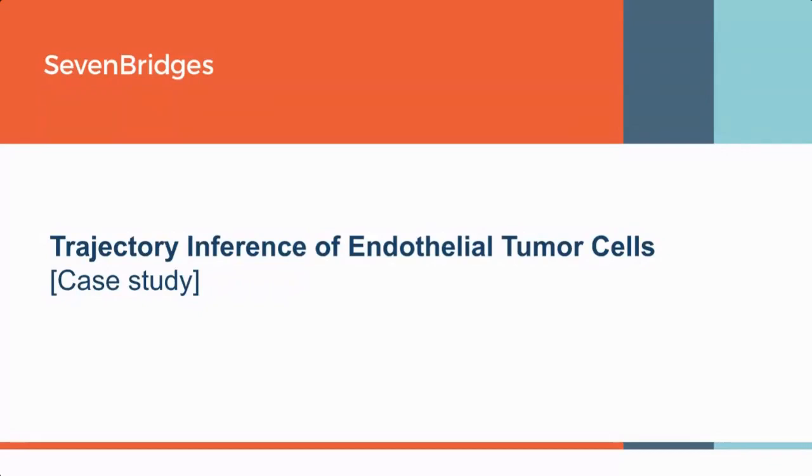This would be our last example of how these tools can be used, and we would like to present the trajectory inference analysis conducted on full-length data from endothelial tumor cells that are isolated from mice with melanoma. Next slide, please.